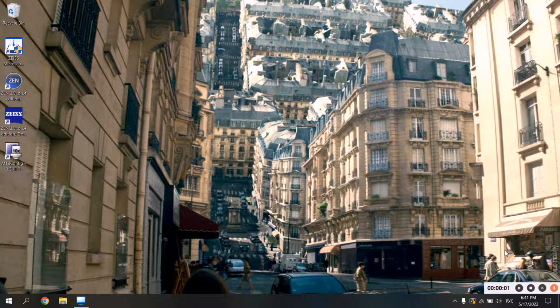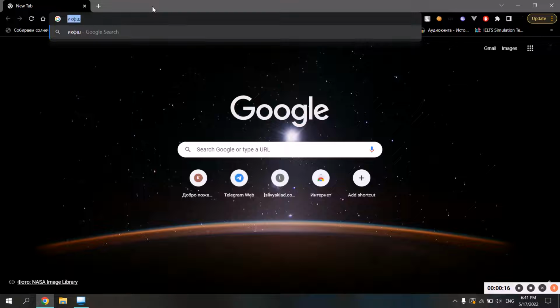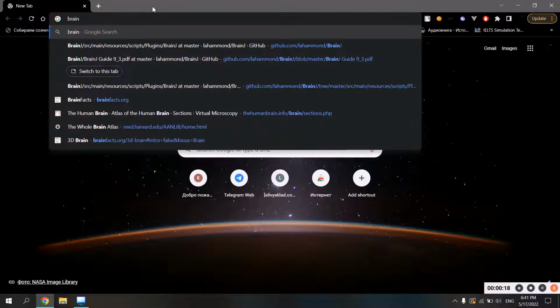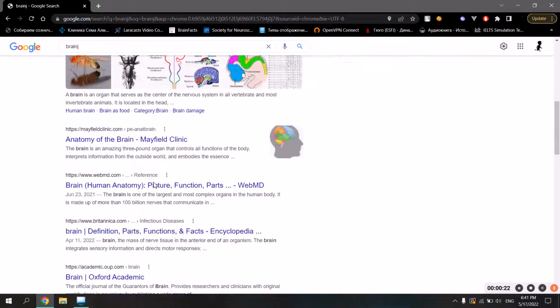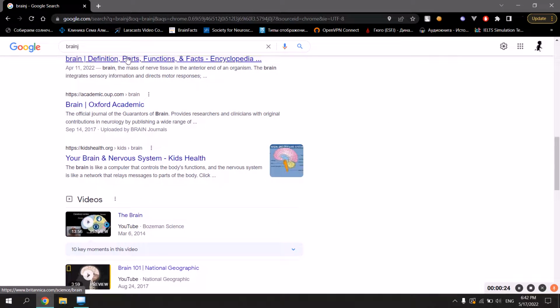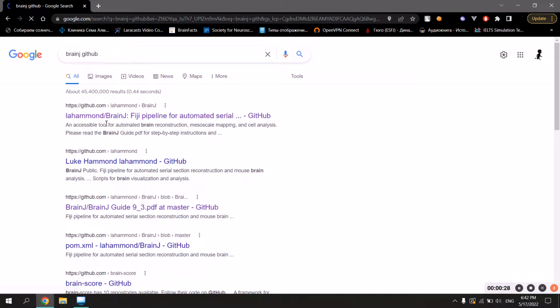Okay, so before we start, I want to repeat myself again. I still recommend you read the guide on the website. You can go to Google, type BrainJ, and just go to the GitHub link. GitHub, yeah. And here is the one that you need.